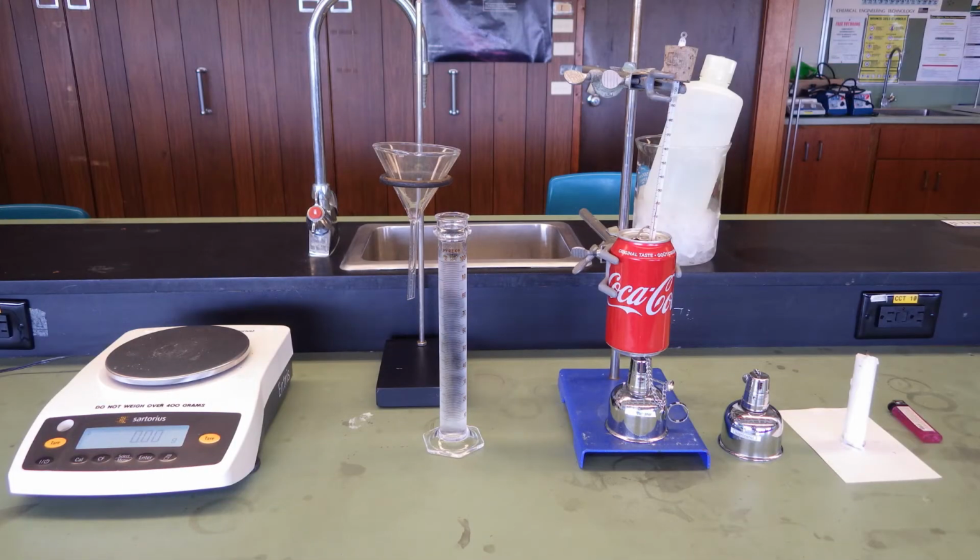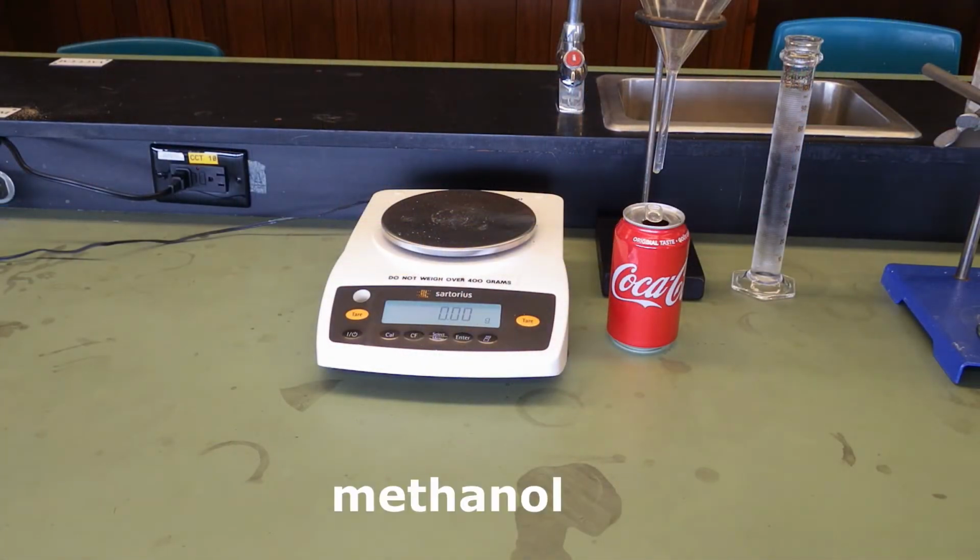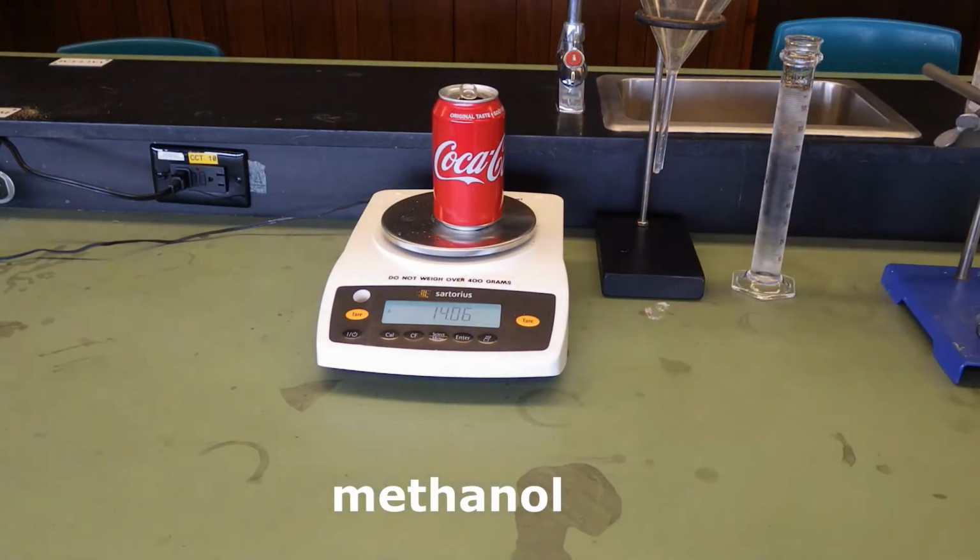So the apparatus includes a balance, a 100 mL graduated cylinder, and a funnel. We're going to use an aluminum pop can for a calorimeter, some cold water, a thermometer, and a couple of alcohol lamps, one for methanol and one for isopropyl alcohol. And there's our candle wax and a lighter. So we'll start with methanol first.